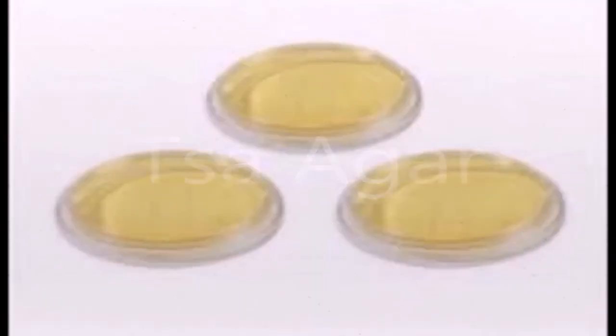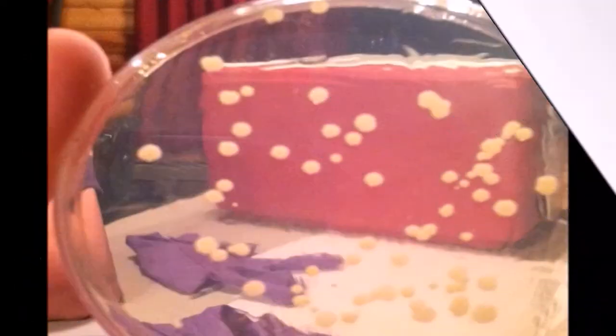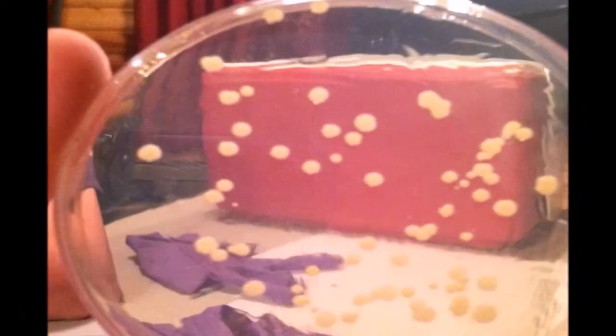The tryptic soy agar, or TSA agar, contains glucose and amino acids for the growth of most microorganisms. It will not select for gram-positive or gram-negative because both groups will grow on this agar. It basically just shows us that we have a particular bacteria growing, but not what type of bacteria it is.